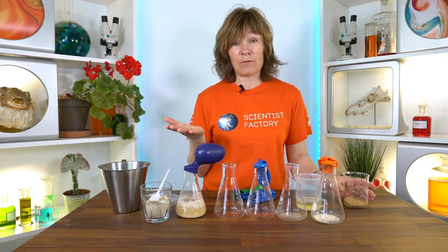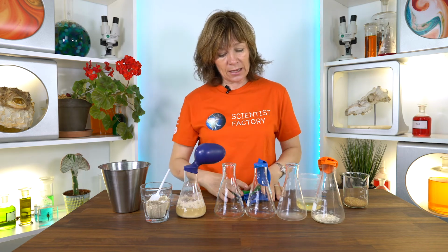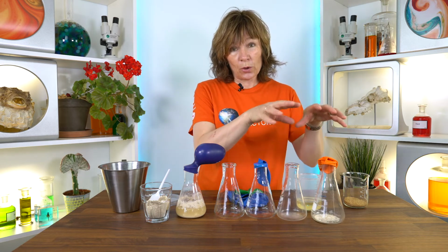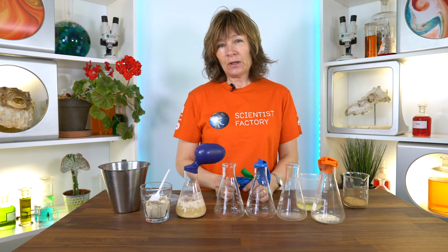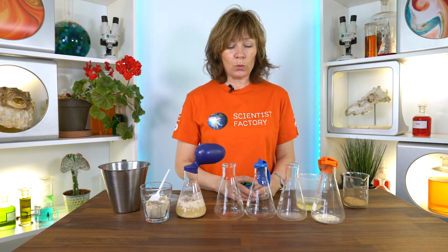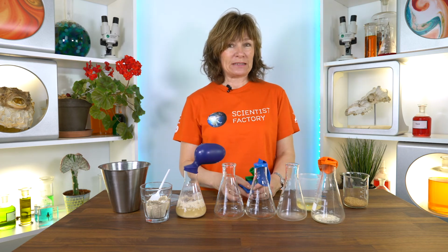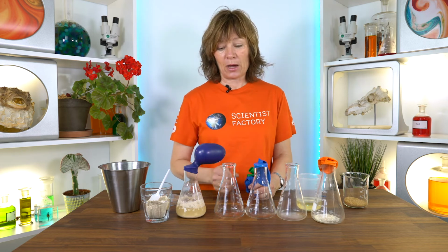And maybe you also have other ideas, that you can find something around you that you want to test. And we suggest that your students work in groups to put up a whole series of different combinations. But the details and how you organize it, it's really up to you. Maybe you want to be very controlling and structure the whole investigation, or maybe you want to let your students go more freely about it.